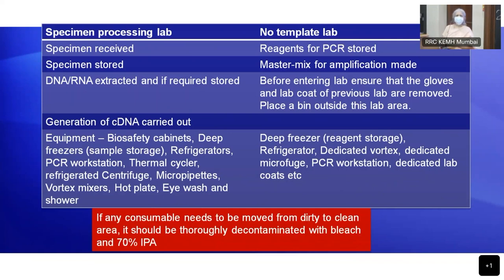So any consumable that needs to be moved from one area to the other, I'm talking about those being moved. Say pipette tips are being used with the extraction tool, and there are no pipette tips to run the PCR or to prepare the master mix. What will you do? You have to take them from this lab. You cannot say, I'll do it tomorrow.